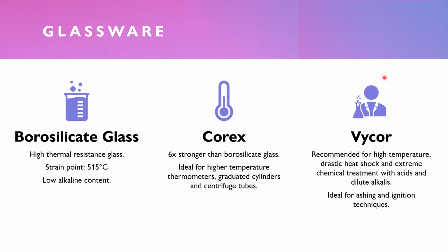Glasswares that are used in the clinical laboratory usually fall into one of the following categories. Kimax or Pyrex, so that's borosilicate glass, the very famous Kimax or Pyrex. There's also Corex, or the aluminosilicate type of glass. There's also high silica glass. There's also Vycor. Vycor is the acid and alkali resistant type of glass. There's also low actinic or flint types of glass used for disposable material. But let's discuss each one of them one by one.